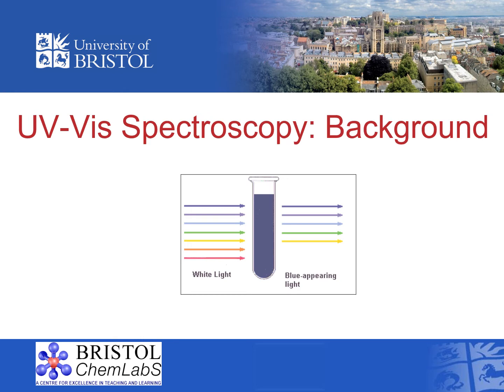In the example shown in the image, the red and orange wavelengths are absorbed by the molecule, and therefore wouldn't be detected by a light-sensitive detector. If there is a higher concentration of the molecule in the solution, shown above, more red or orange light will be absorbed and therefore less transmitted and detected, making the maximum absorbance higher. You can use this correlation between concentration and absorbance as a method to work out the concentration of such a molecule through the creation of a calibration curve.